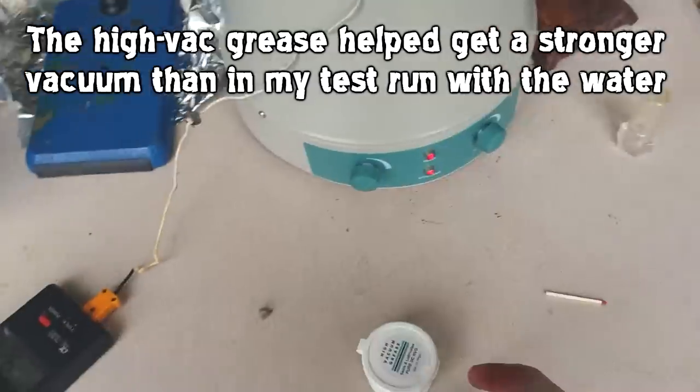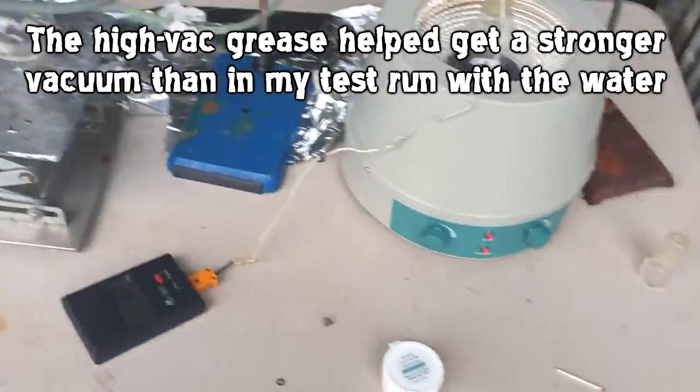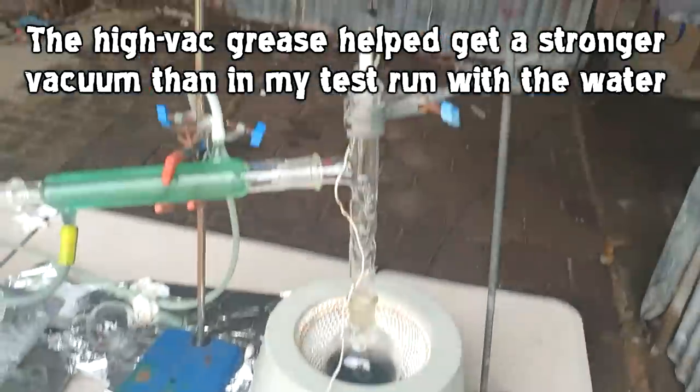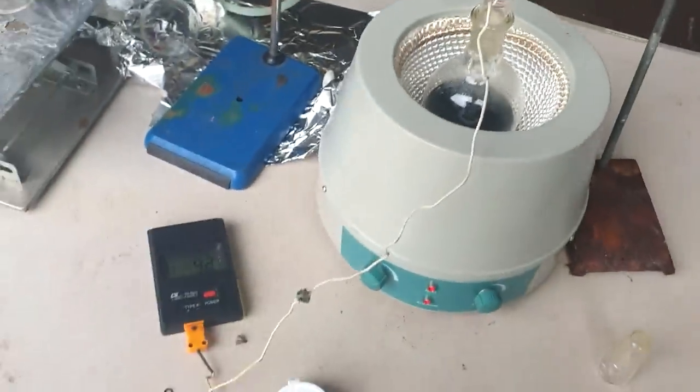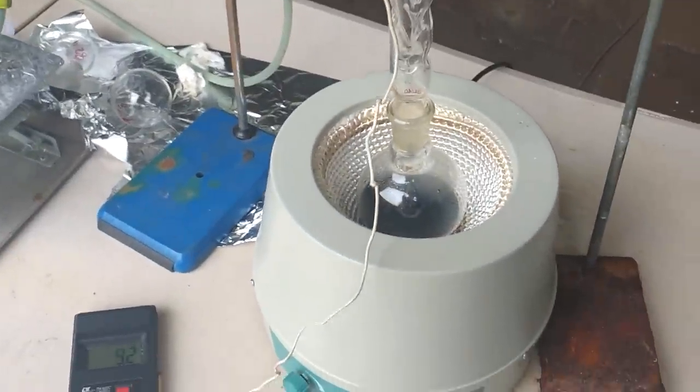finally. We're up and running. We've got our nice high vacuum grease on all the joints. We've got our tar solution in there. It's heating, it's stirring nicely. We're pulling somewhat of a vacuum, thermometer in there. It's currently 9 degrees, which is fucking cold for where I am. It's fucking freezing, I'm dying.